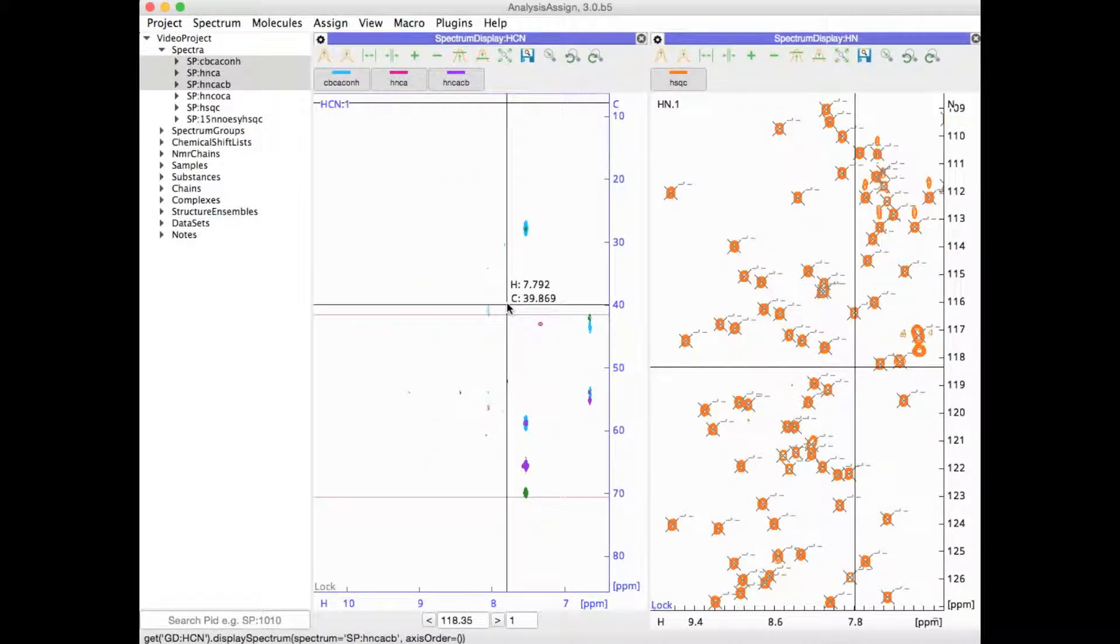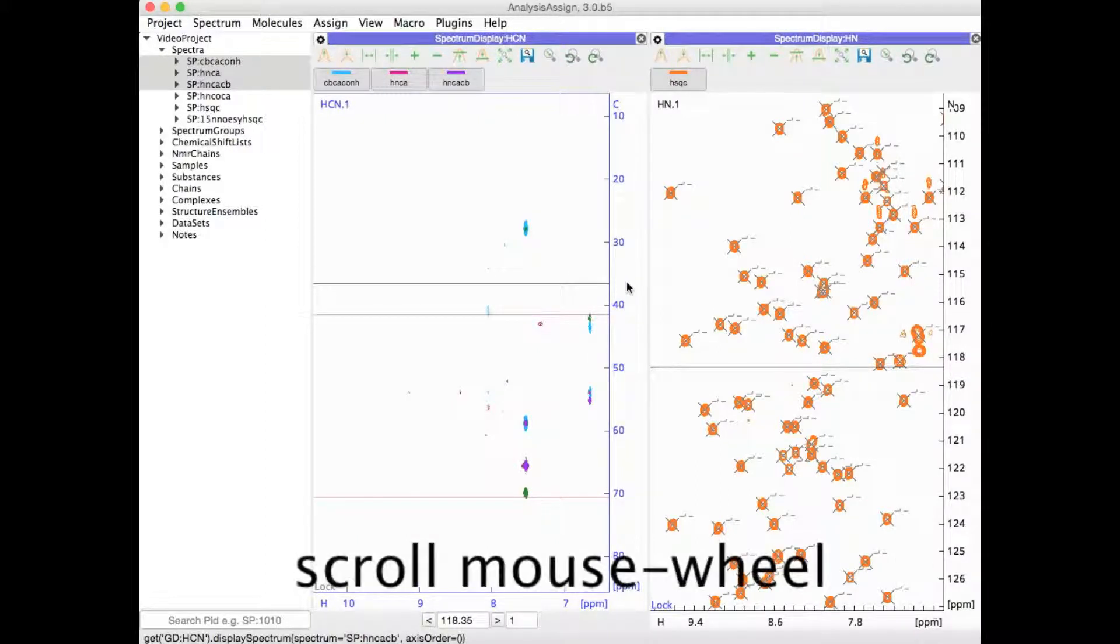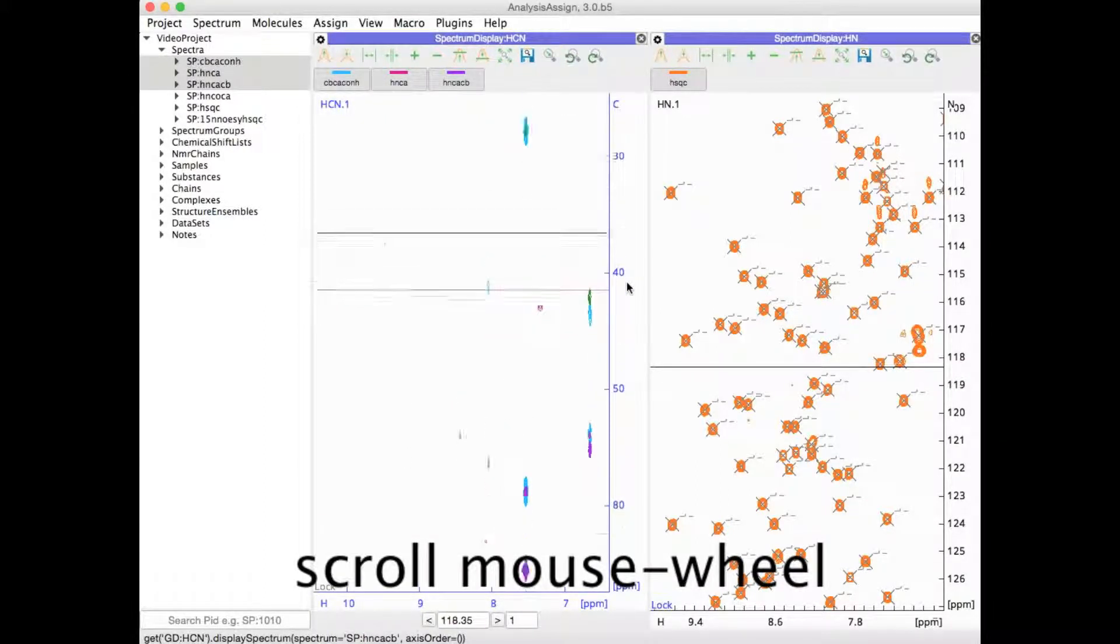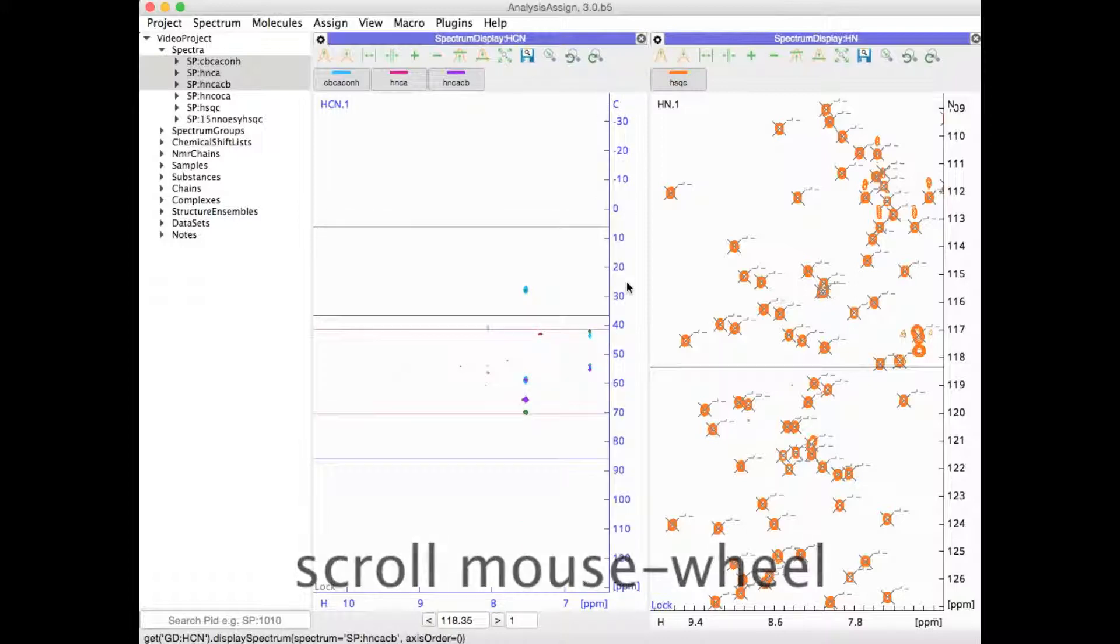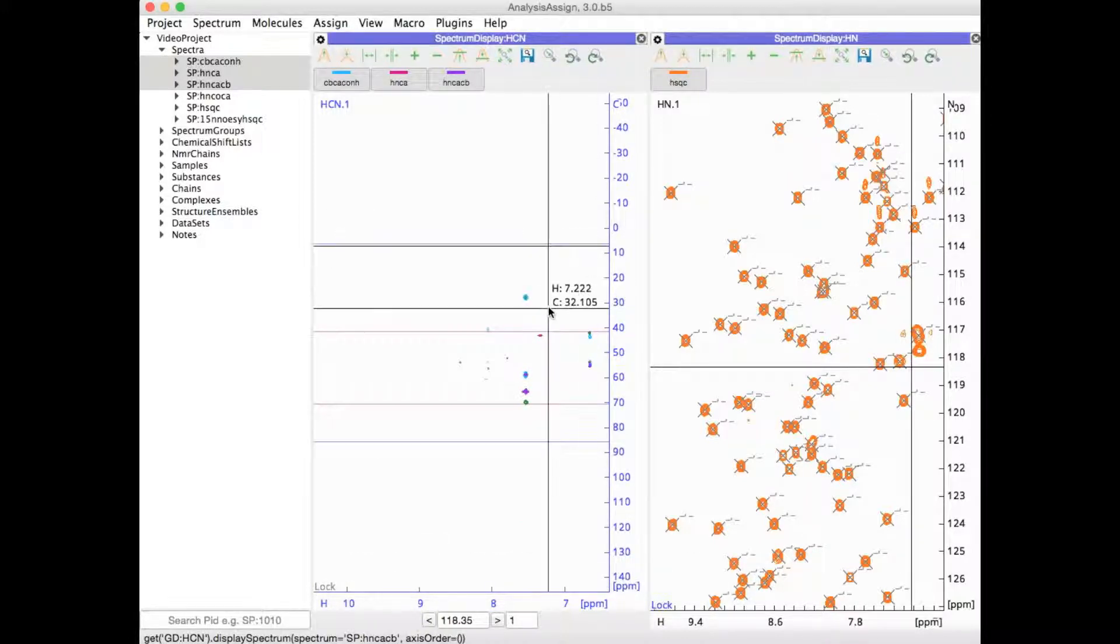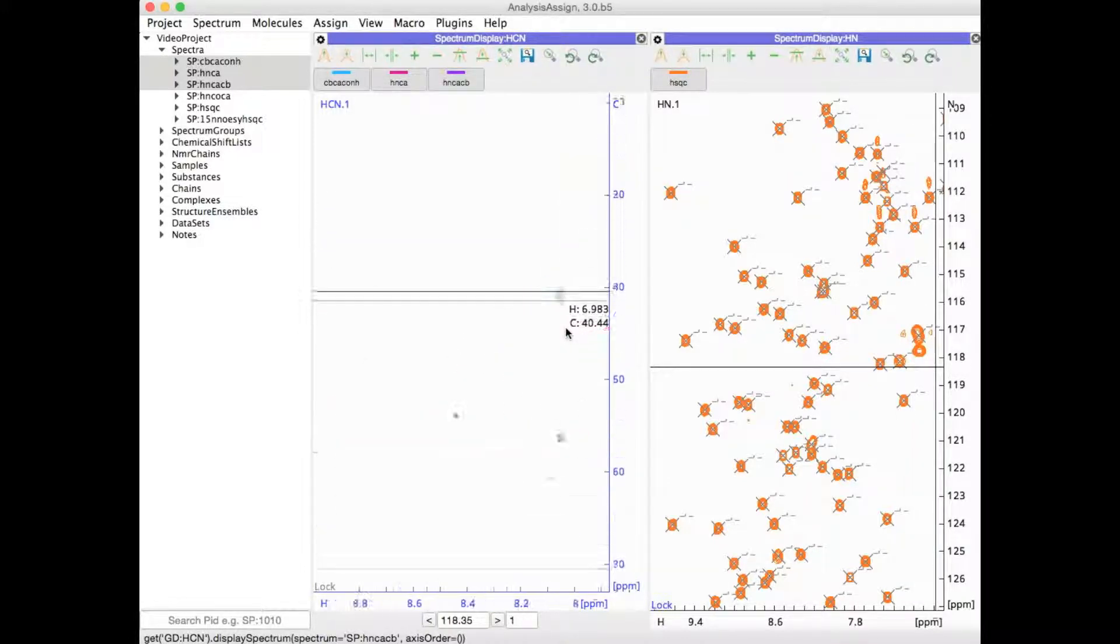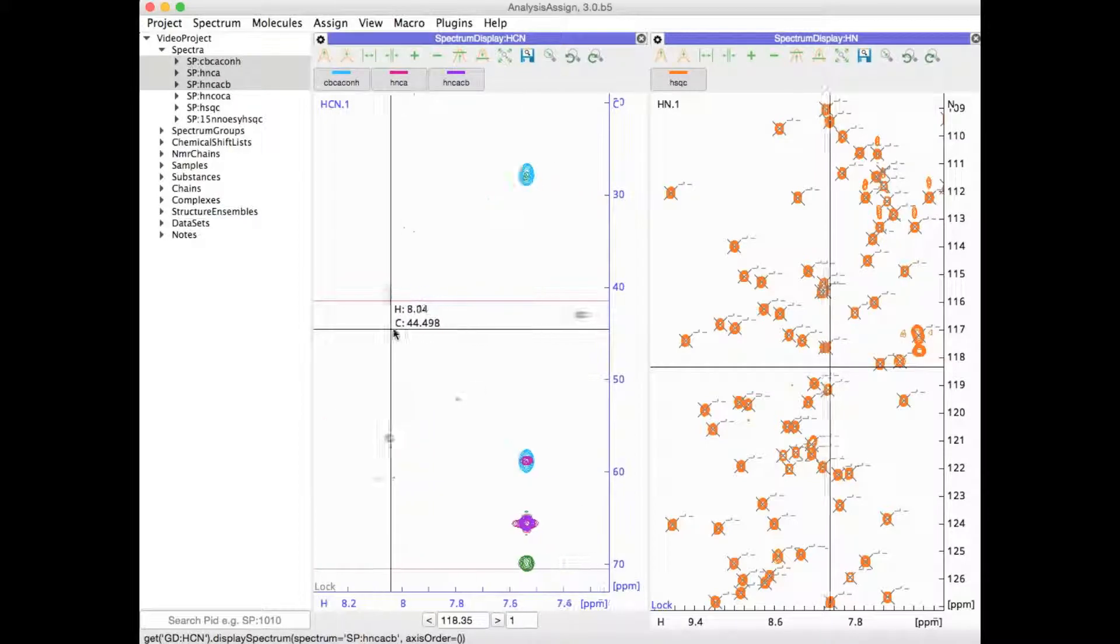You can change the aspect ratio of your spectra by going onto one of the axes and then scrolling with the mouse wheel. This effectively zooms in selectively on that axis and means that you change the aspect ratio.